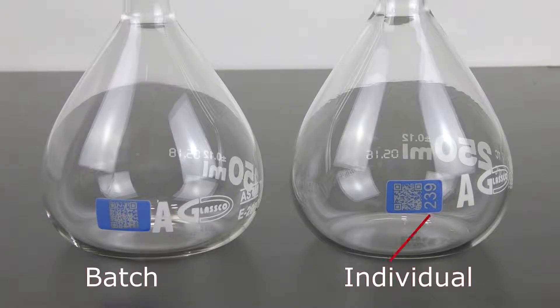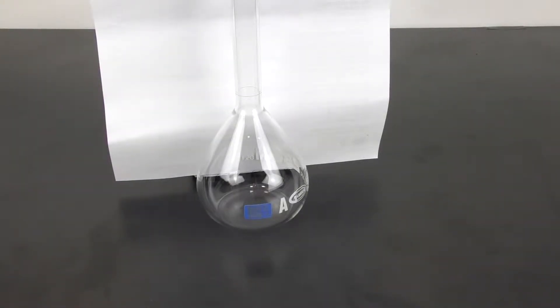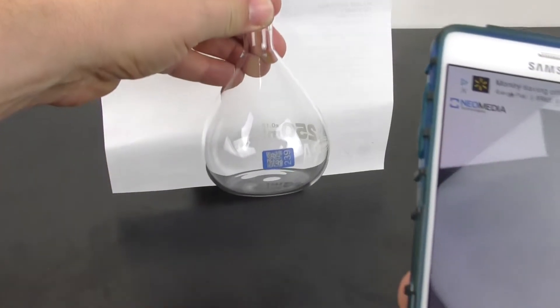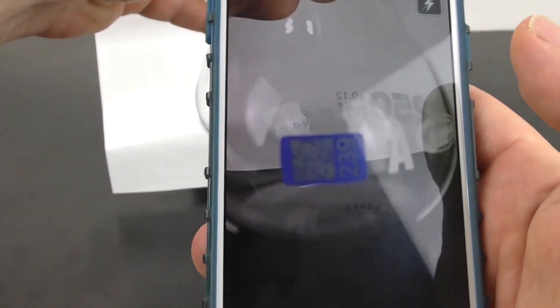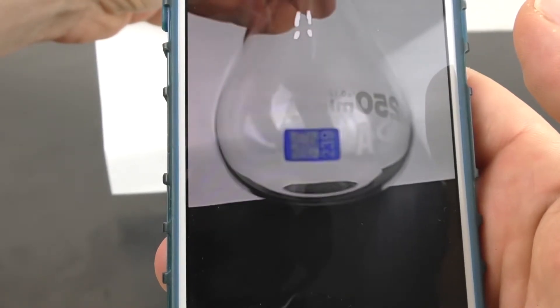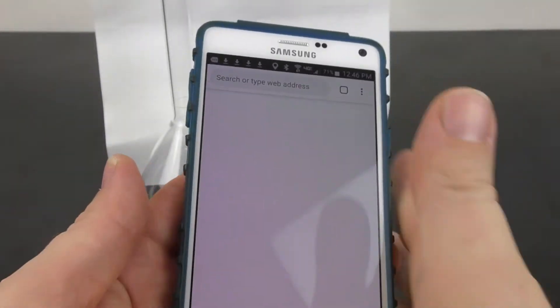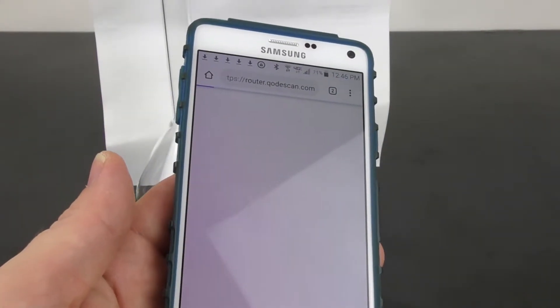If you notice, the flask on the right also has three digits — those are the ones that are individually certified. For individual certification, you would follow the same procedure: open up the app and zoom in on the QR code, and there is just one simple extra step you have to do.